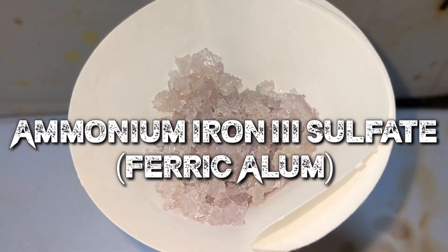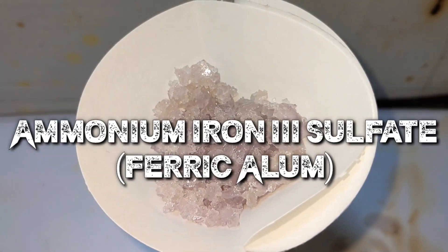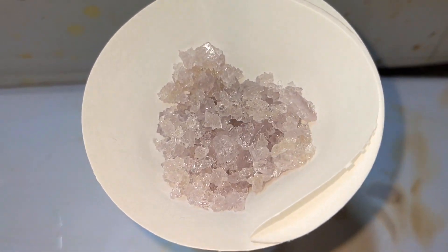Hello friends, in this video we make ammonium iron(III) sulfate, also called ferric alum.